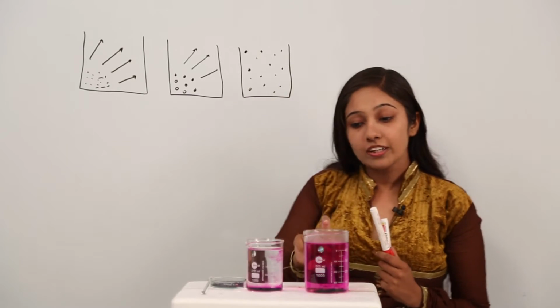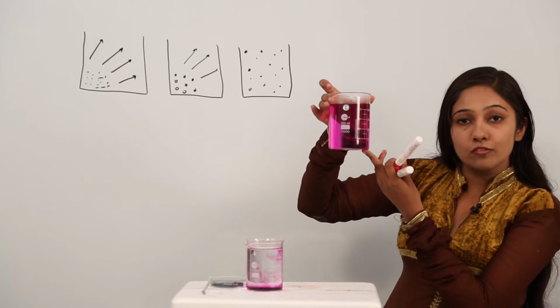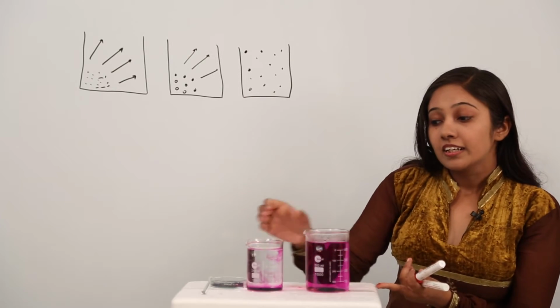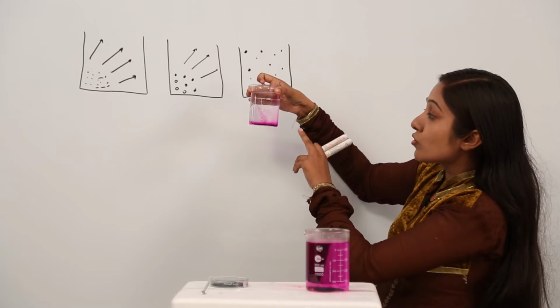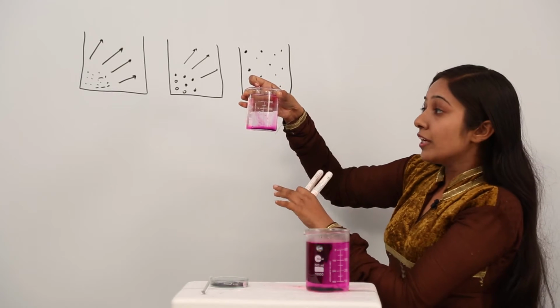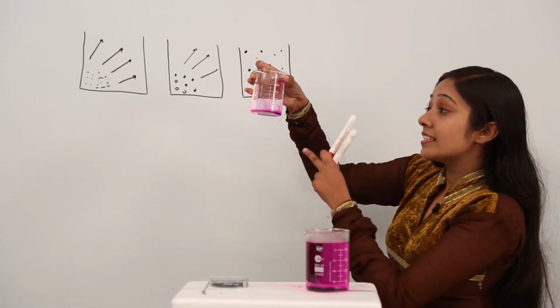This is what we are demonstrating in these two beakers. So as you can see, in case of the beaker which was having hot water, there is a faster rate of diffusion, but in the beaker containing cold water, you can see that the rate of diffusion is quite slow. Maybe this is not very clear to you, but when you do it at your homes or in the lab, you can see slowly these molecules rising up and they are going to fill in the space and spread evenly in the entire beaker.